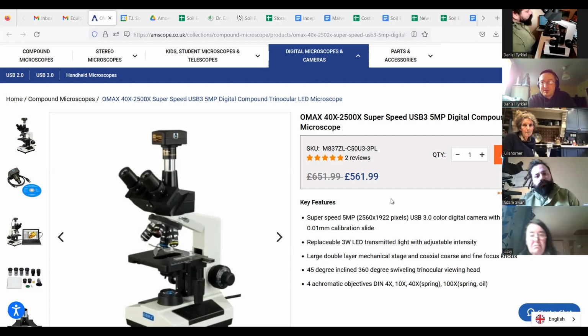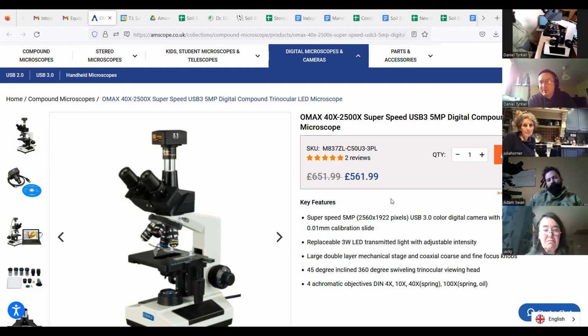The challenge is with the software that you saw Adam use on the screen, and a lot of people have reported that it didn't work for them on Apples. However, Paula, who's also in the room with Adam, I believe we successfully installed it on her MacBook Pro. So I would say now that yes, it is fully compatible with Apple computers. So the only thing you're thinking about in terms of compatibility is the camera. Obviously, it doesn't matter for the microscope.